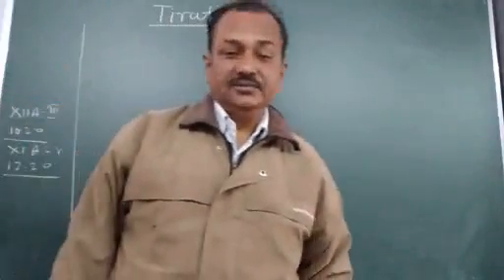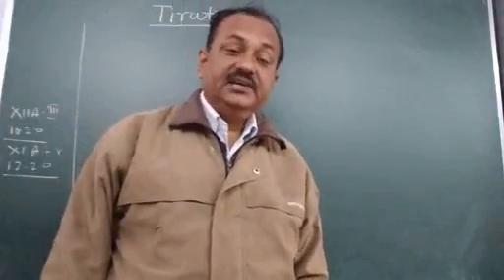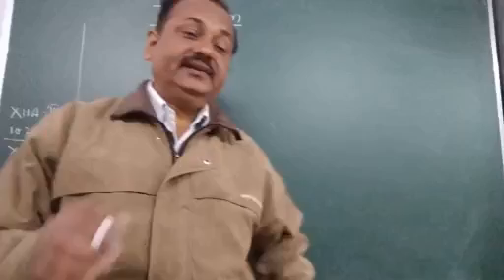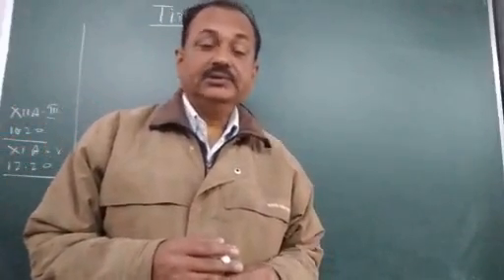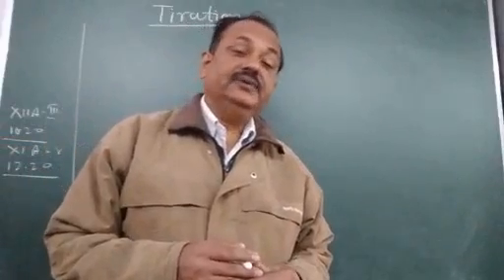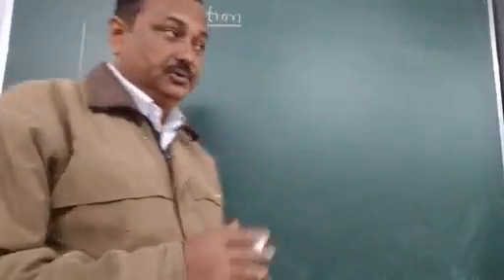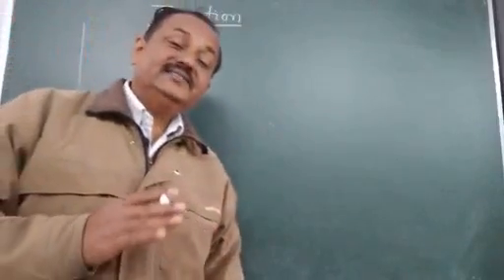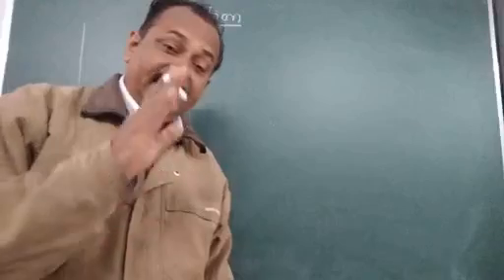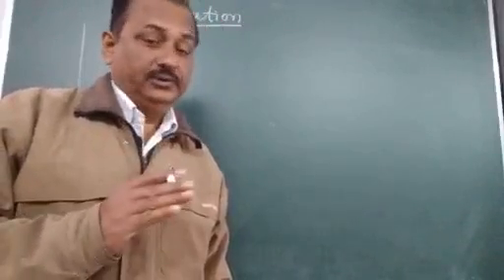So students, good morning. I am going to explain something about the titration. You know titration? It is a way to find out the strength of an unknown solution by using a known solution.